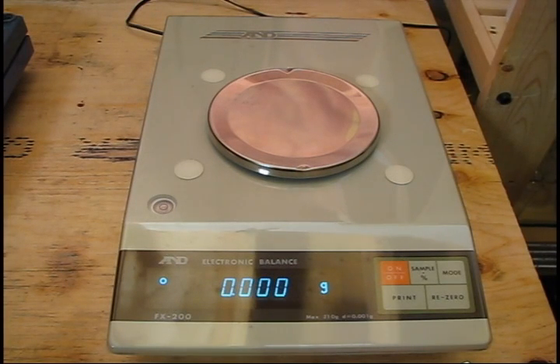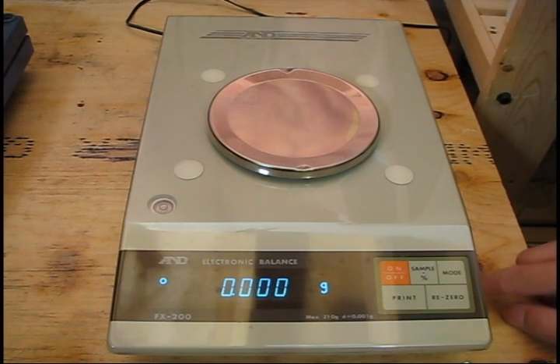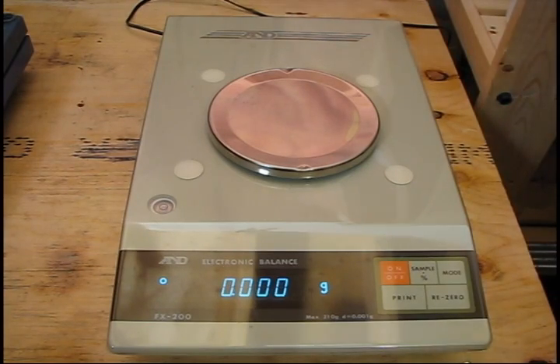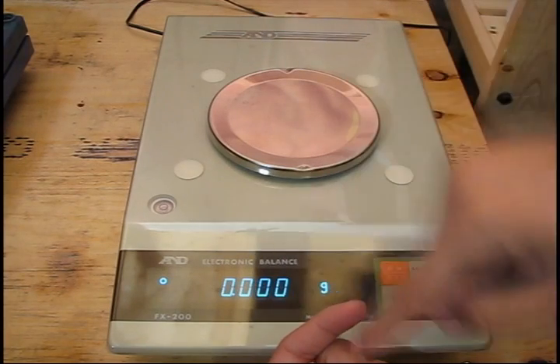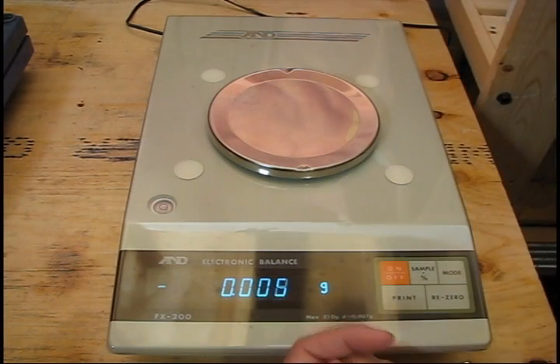Now, to address this pet peeve I was mentioning earlier — I've seen so many people do this, it really annoys me, especially when people claim to be analytical chemists. That is leveling the scale. All scales will have this leveling bubble and adjustable feet on the front. The main reason for leveling the scale is because the actual mechanism that this pan rests on wants to move vertically down onto a load cell. If it's at an angle, some of that force will be distributed into the side of this motion, and as a result you're not going to get an accurate value.